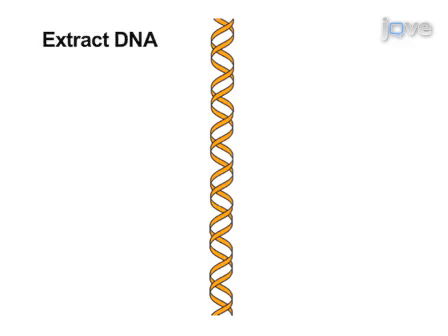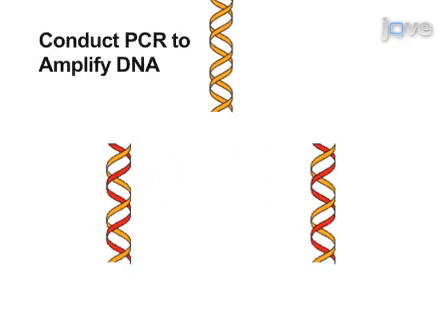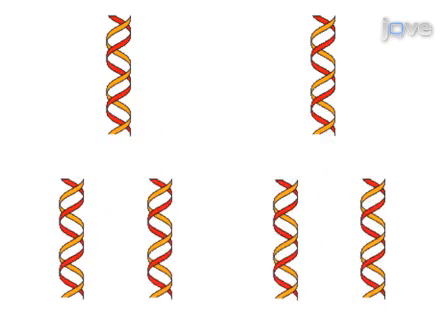The next step is to extract nuclear and plastid DNA from the collected tissue. Next, polymerase chain reaction is performed on the extracted DNA using variety-specific primers that target sequence differences in the plastid trnL-F region, as well as appropriate positive and negative controls.